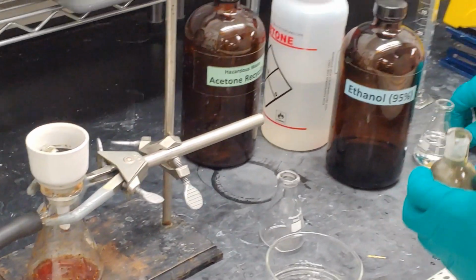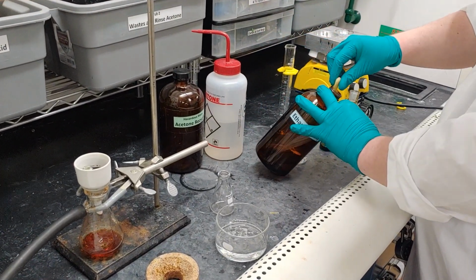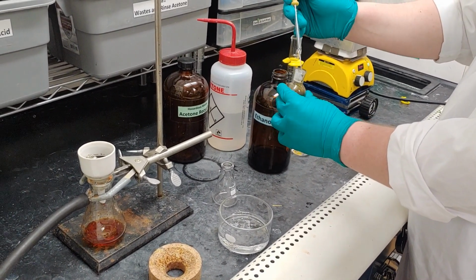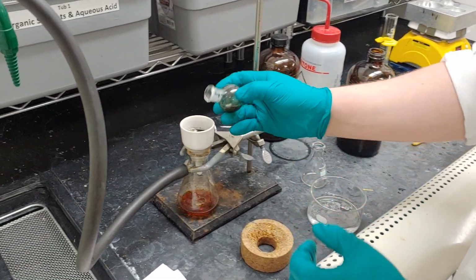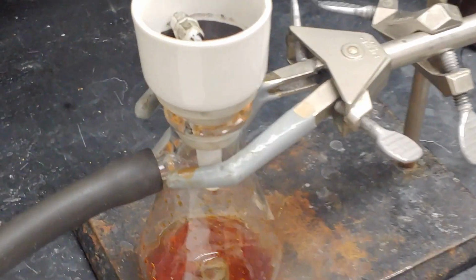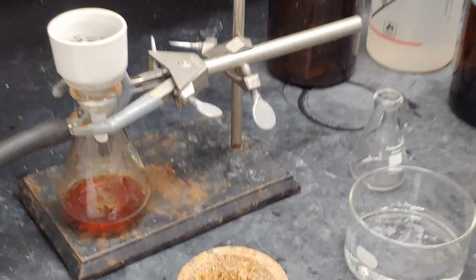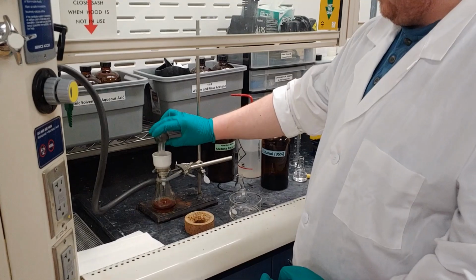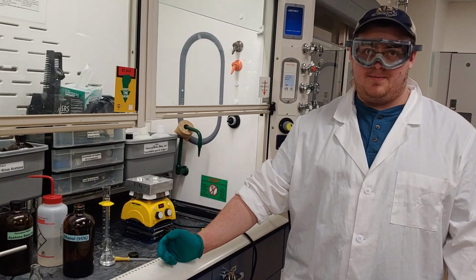What I'm now going to do is wash with a small amount of ethanol, about 1 milliliter. Now that I've done that, I can move on to the recrystallization step.